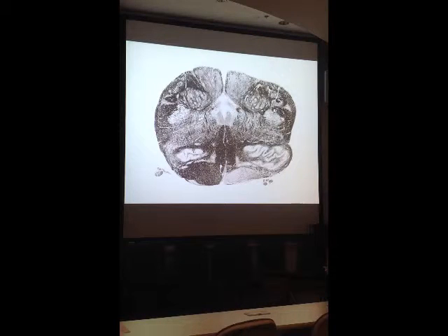Now we're pretty far low down in the medulla, so this is probably far enough down to call this the pars caudalis of the spinal trigeminal nucleus. And why are these neurons important? Because many of these neurons are secondary neurons that relay pain information from the ipsilateral face. Remember that? Okay.